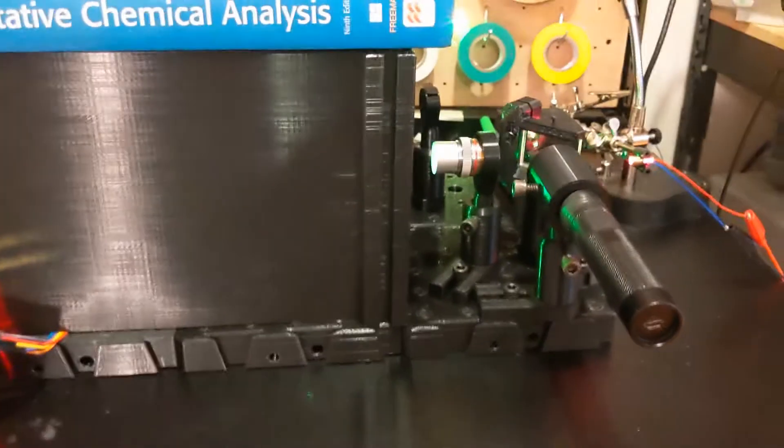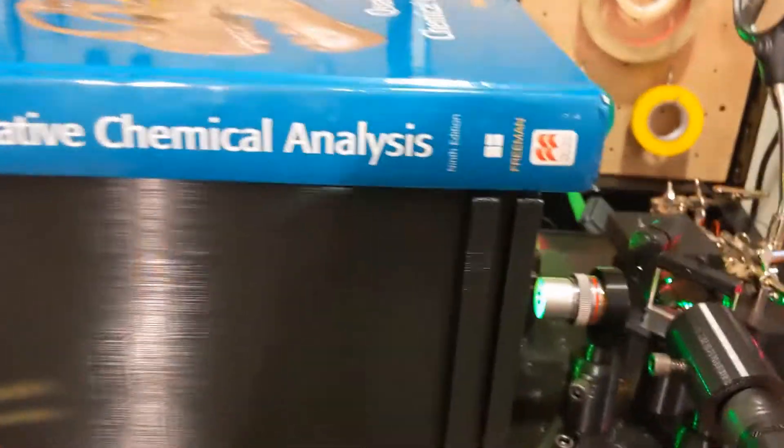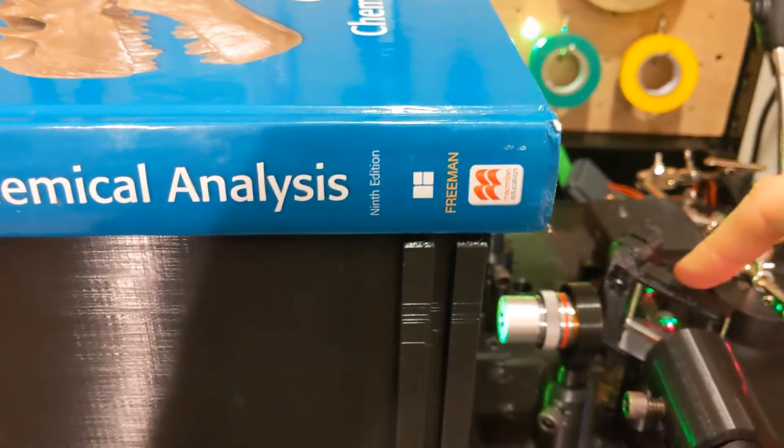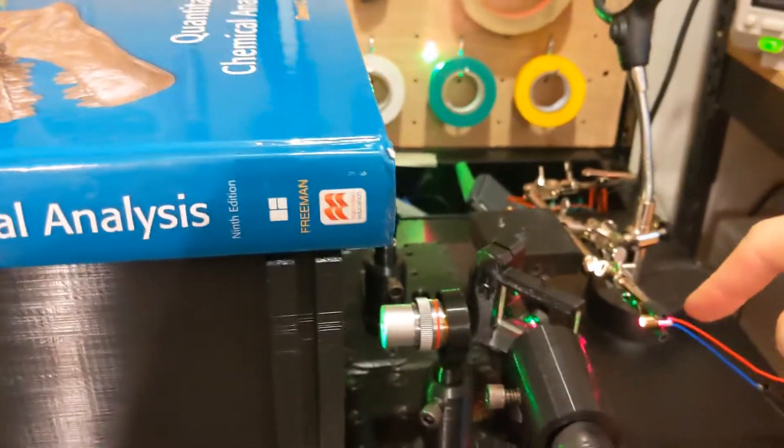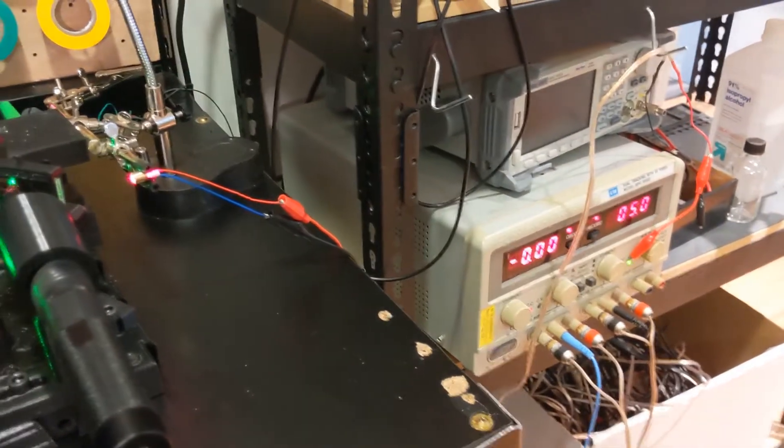Here's the spectrometer. Right here is the green laser pointer, right here is the 5050 beam splitter, and right here is the red laser pointer — I'm putting five volts to the red laser pointer right now.